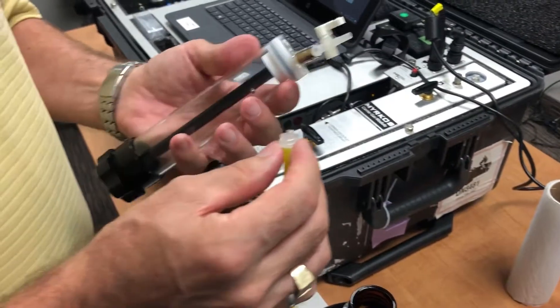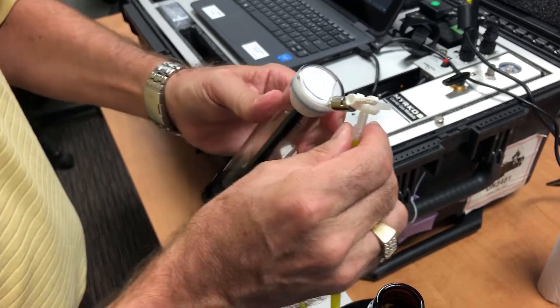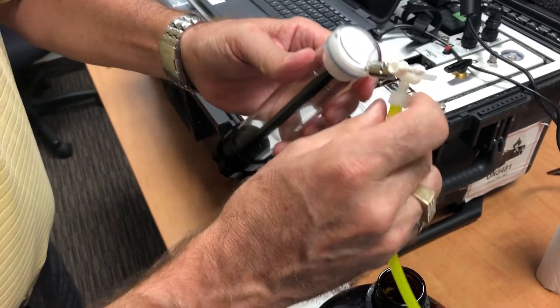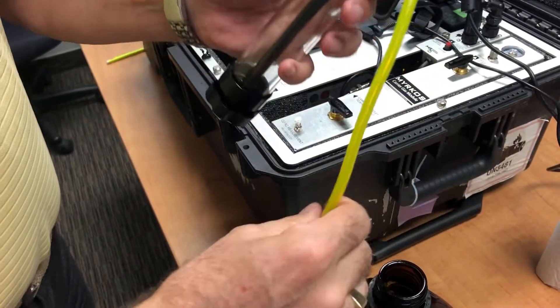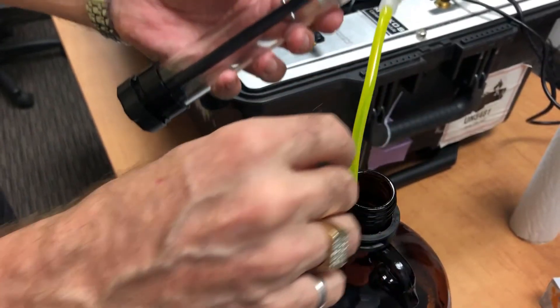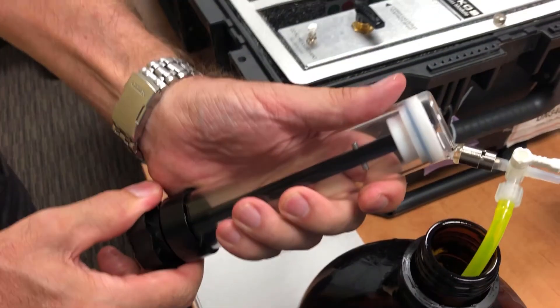For the oxygen-nitrogen test, it's the same thing that we did before for the 7-gas. So we're going to fill the syringe again, full of oil.